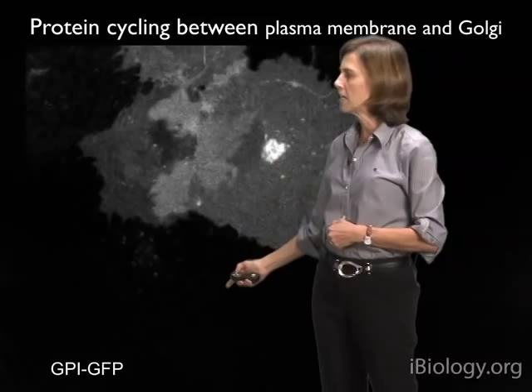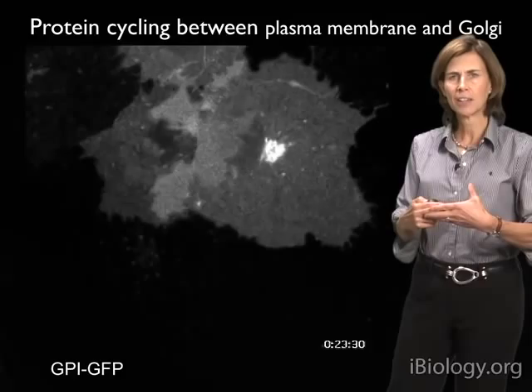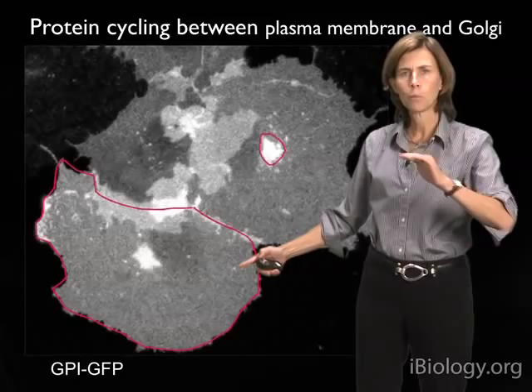Now, you don't see any recovery in this region of interest because, in this case, we photobleached the entire cell. And because these cells are treated with a protein synthesis inhibitor, cycloheximide, there's no new protein synthesis, and so no way for any fluorescence to return in this experiment. After all, after photobleaching, these fluorophores are permanently unable to exhibit fluorescence emission.